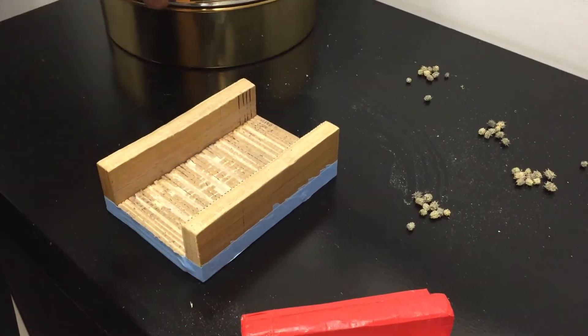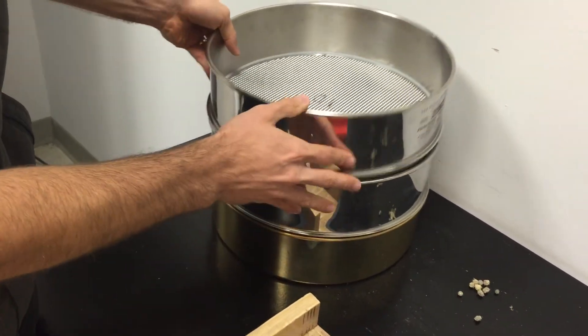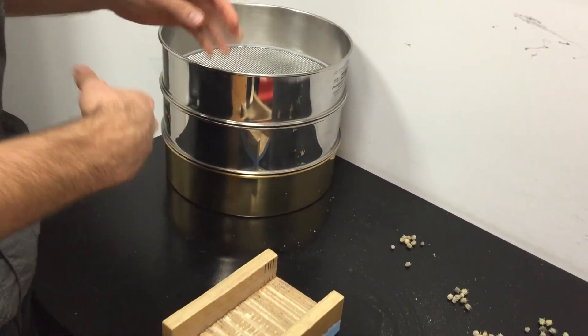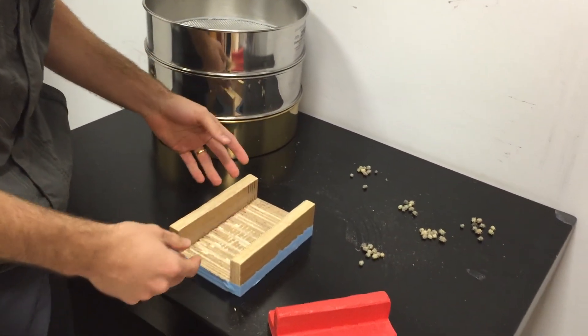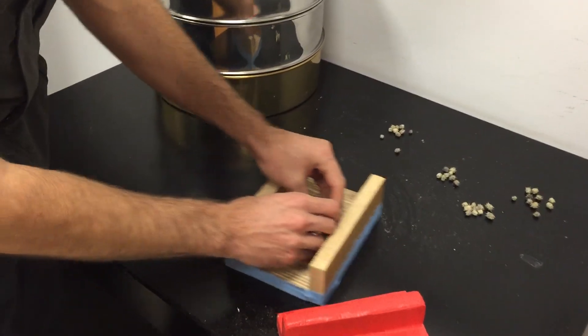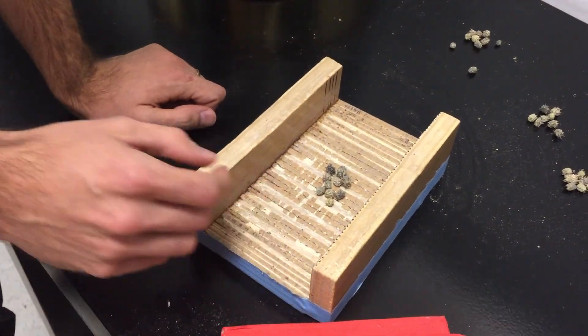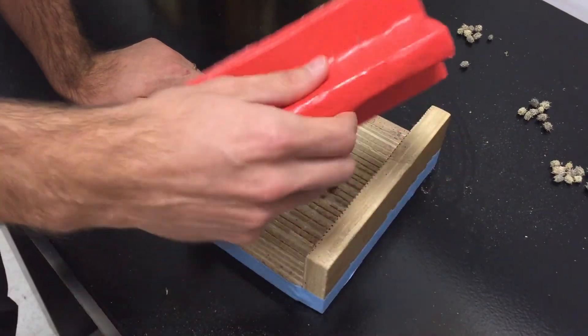I've already been isolating some seeds as you can see here, but right now I'm just going to show you a real quick demonstration of how I do it. I'm doing a hundred pods and whenever I do this step, I only do about ten pods at a time.